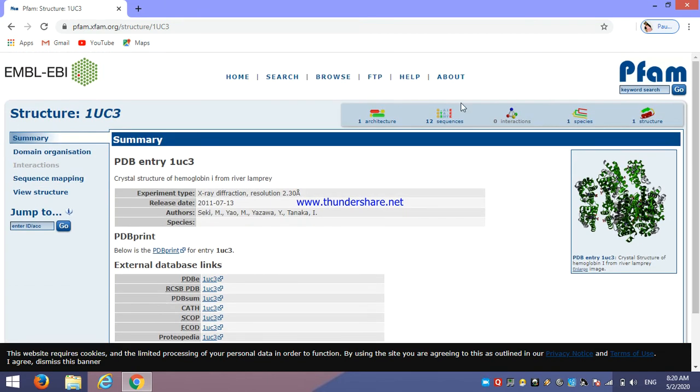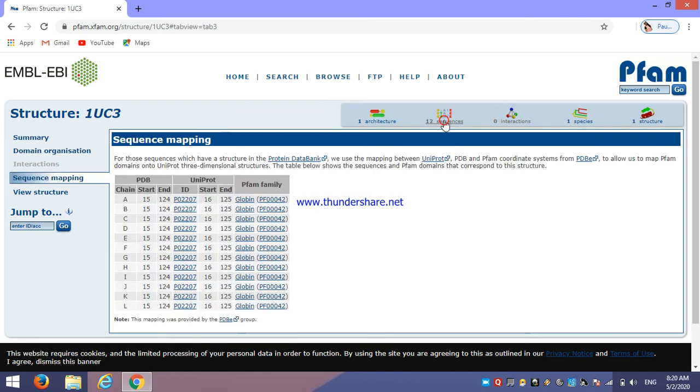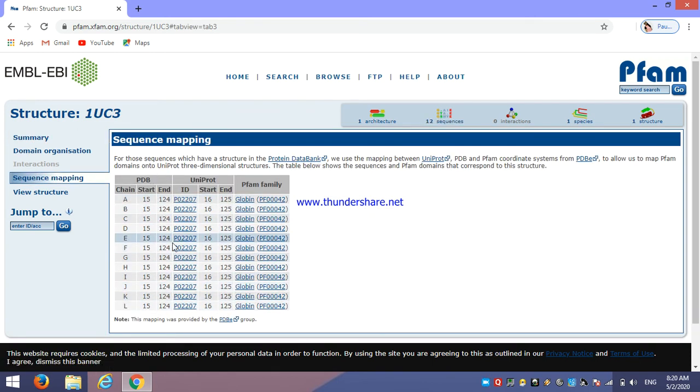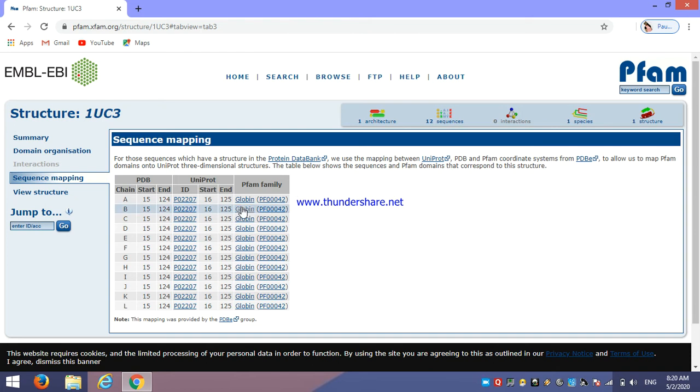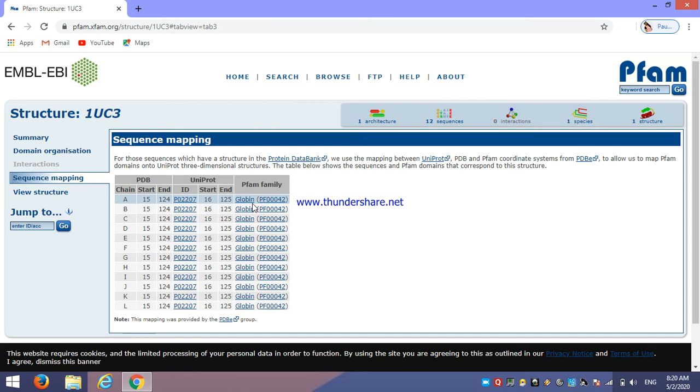Now here just click on the sequences which shows about 12 sequences which are present in PDB and UniProt which are related to our search query, that is PFAM family. Then click on this.